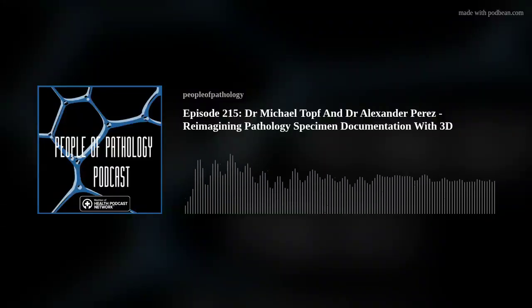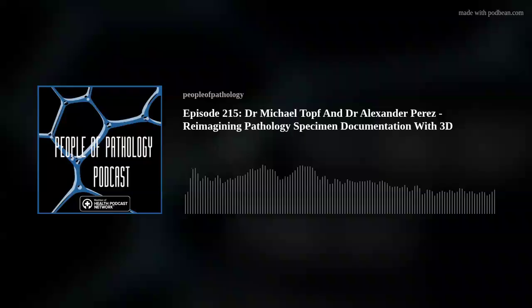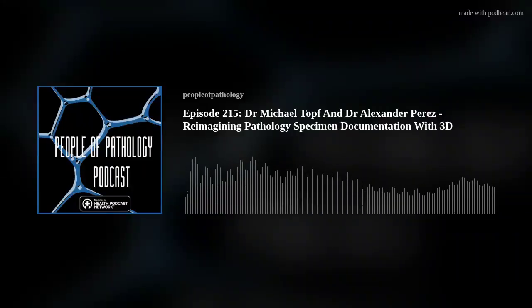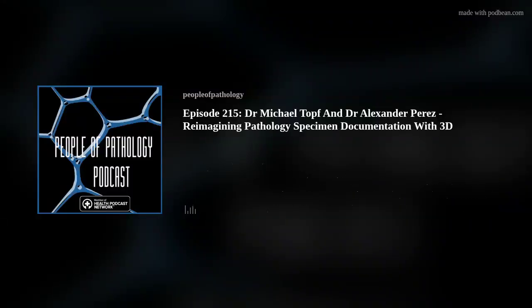Okay. Yeah, I'm not a breast surgeon, but based on my experience watching those surgeries and the processing of the specimens in the gross lab, I think that would be really useful for potentially breast oncology. I also think it'd probably be useful for bone and soft tissue sarcoma, as they're trying to quantify response to neoadjuvant therapy. Alex could probably comment on that a little bit better.